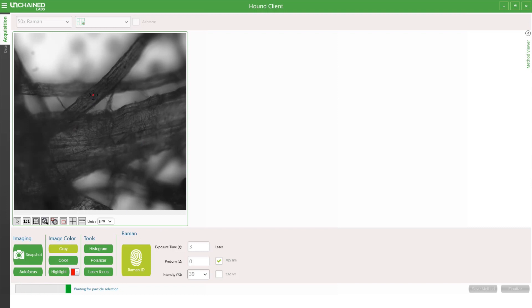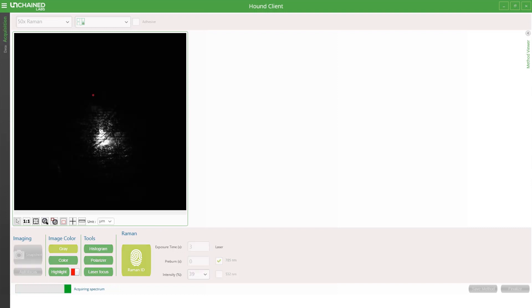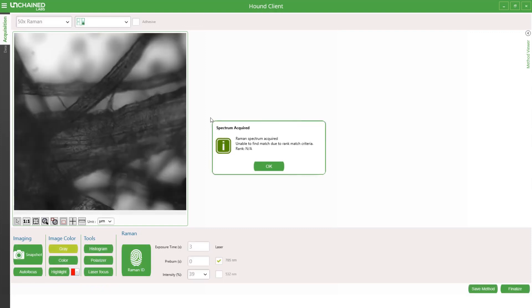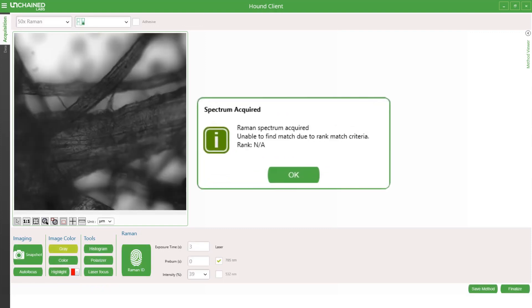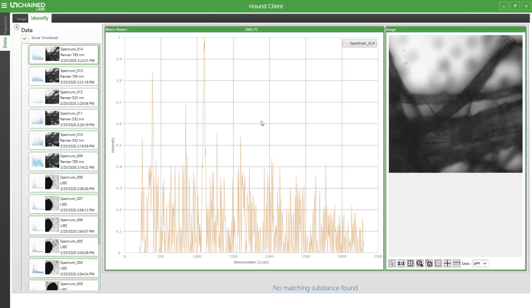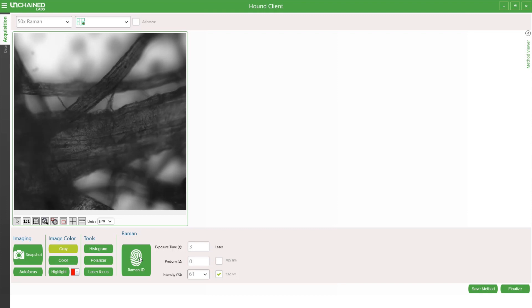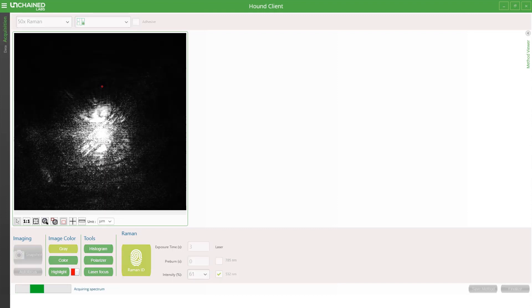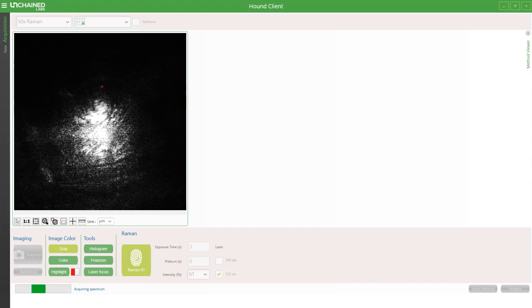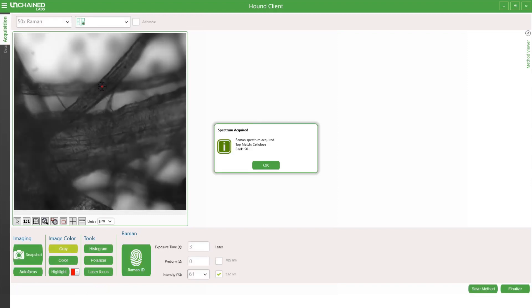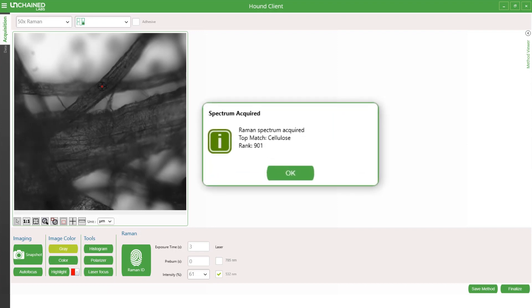I'll repeat this with the third particle. Starting with the 785 nanometer Raman laser, not only is there no match, but if I look at the spectrum, it's just noise. So what I'll try is to use the 532 nanometer Raman laser. With this, I can see I have a match of cellulose.